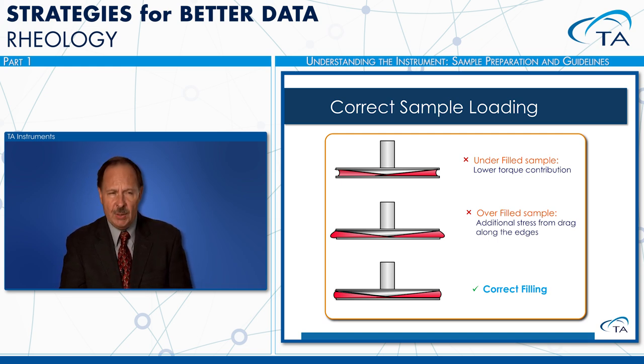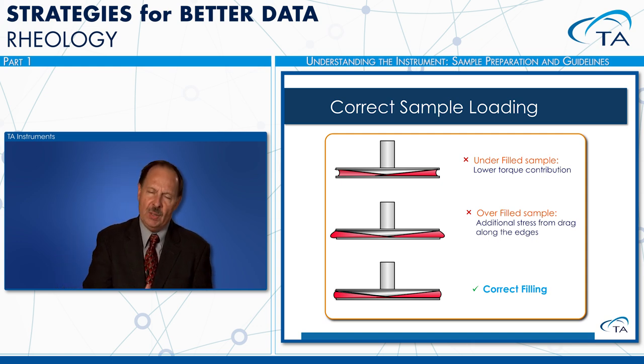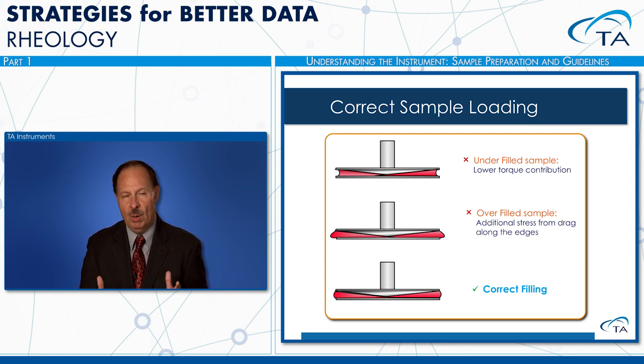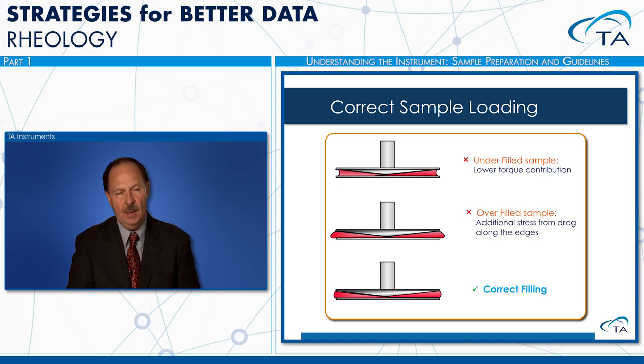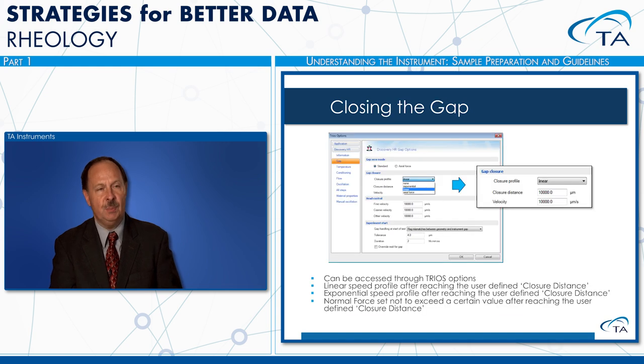Okay, so here is an overfilled sample. If you overfill it, you'll see the viscosity coming in higher than it should. And some things vary with how sensitive they are to this overfilling. And then here it's just right. So here there's a little bit of a bulge to the sample. That's okay. And we should get good measurements when we have this filled in this fashion.